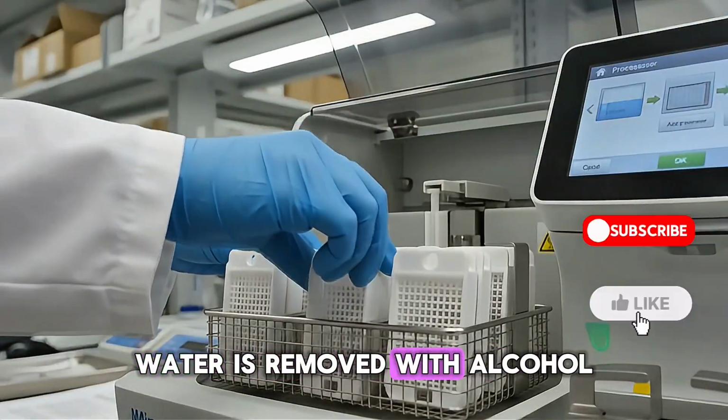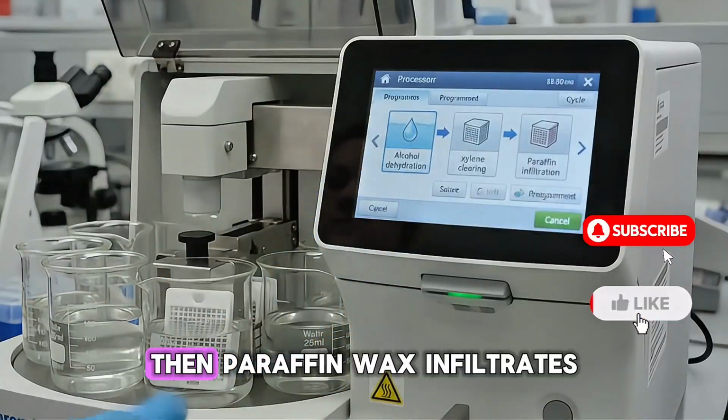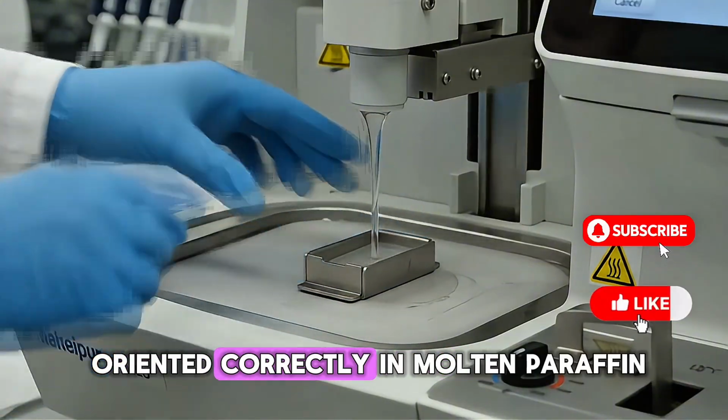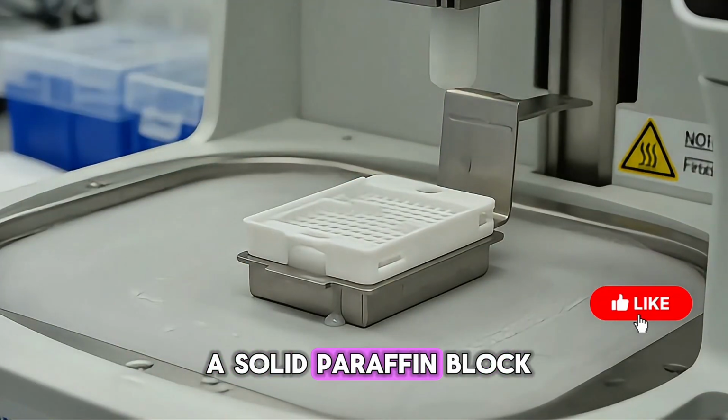Water is removed with alcohol. Alcohol is replaced with a clearing agent. Then paraffin wax infiltrates. Next is embedding. Each tissue piece is oriented correctly in molten paraffin, then cooled to form a solid paraffin block.